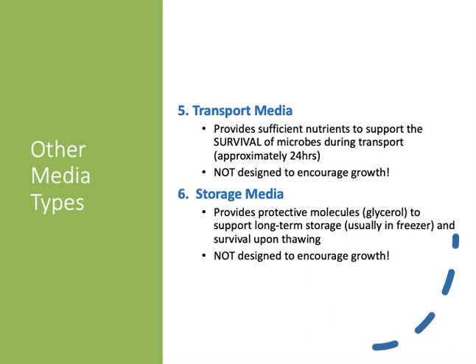What storage media does is use a molecule called glycerol to replace the water inside of the living cells. When you place microbial cells into glycerol, the glycerol will go into the cells and force the water out.